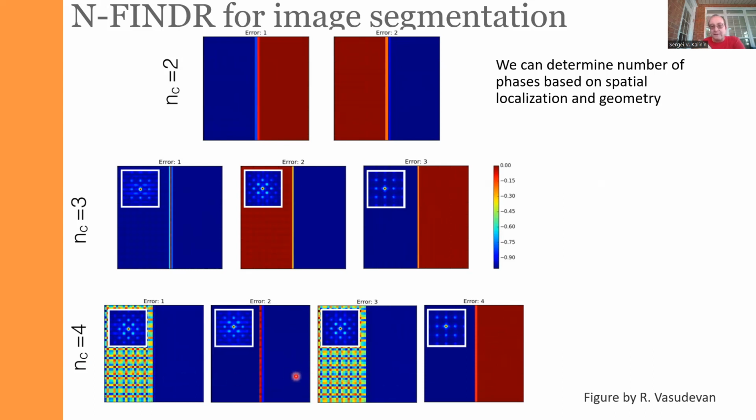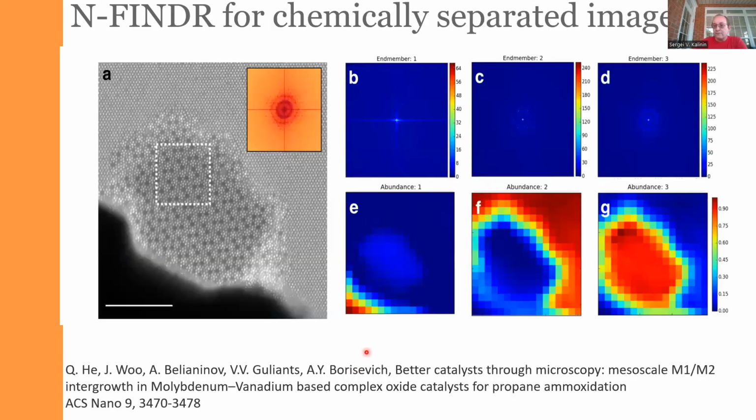So we basically, simply by the examination of the overlap between these images, we can say that this is right, this is acceptable if we are willing to count the interface as the new phase, and this is too much. So it is very easy to come up with a criterion that will basically rule out these phases simply based on the overlap between the regions after some smoothing. So great. Would something like this work for the experimental data?